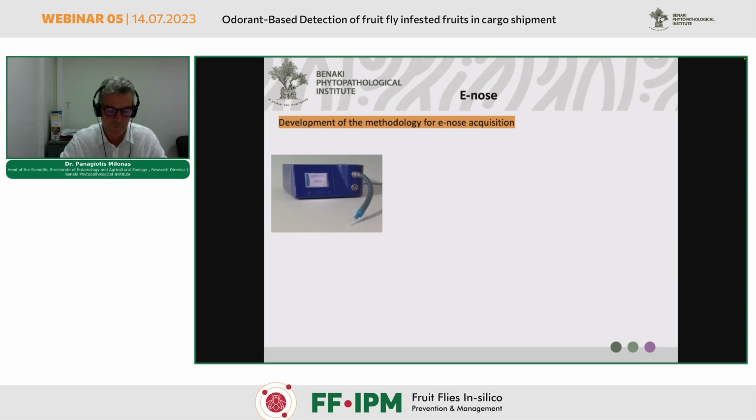And this also involves complicated multivariate statistical analysis of a complex blend. As you have seen, for citrus for example, there are 128 different compounds. And in order to identify compounds of interest, that is compounds that vary reliably between samples and can be used as biomarkers. Now, the precision and accuracy of these sensors relies on the selection of the right predictors that are specific enough and reliably occur above the limit of detection to be monitored by artificial olfaction machines.